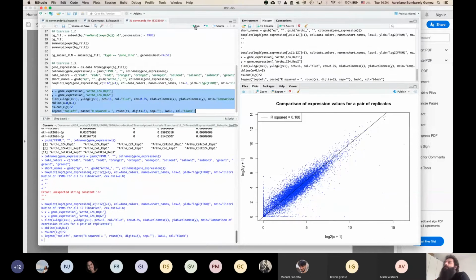Okay, so this is representing the replicates. In theory, it looks like they are not so bad, but keep in mind that the axes here are different, okay? So even if all the samples look like they don't have big changes, that is still normal because we are comparing different samples, okay? But of the same thing, it still should be fine, but this R square is really, really bad, okay?